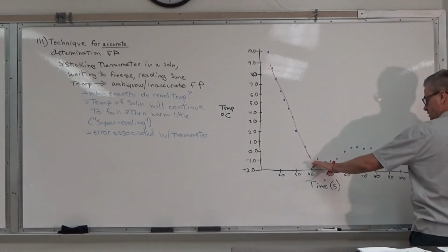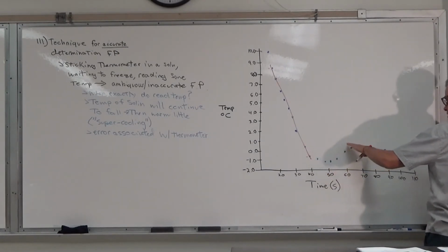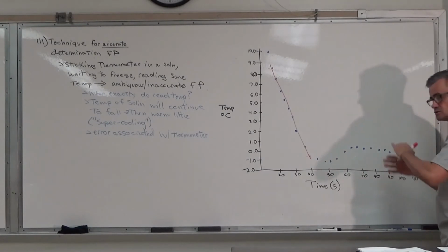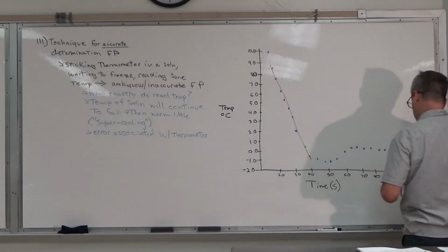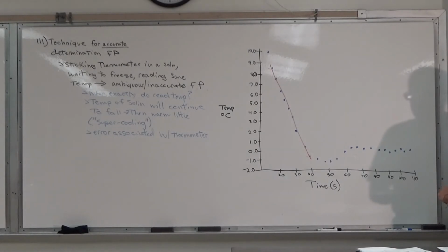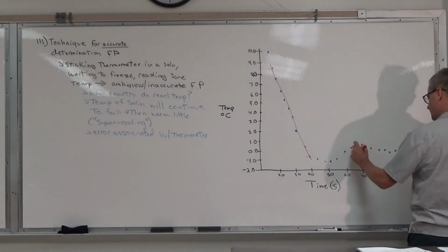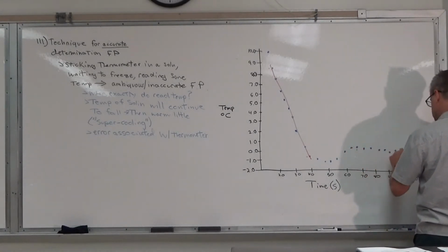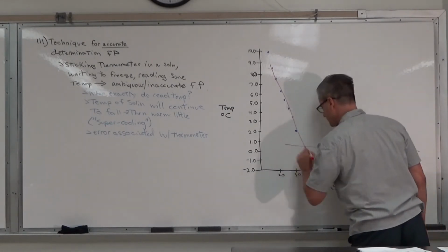And then you want to look here. Now this isn't linear, none of that's linear. You want to find this plateau part, and don't be afraid if it's only a small subset of the data, as long as it's relatively linear. Maybe it's that point and that point, and then generate a trend line for that.